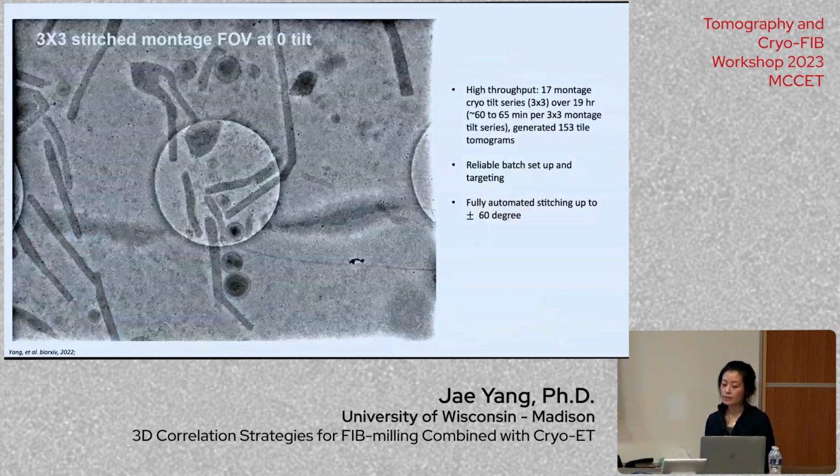So for the montage, this one collected really very efficiently, because I think people probably know that there's another way to collect montage cryo-ET, which is using the hexagonal pattern. It's a very elegant way to do it because it really minimizes your dose and pre-dose irradiation damage, but it ended up having a really restricted beam size.